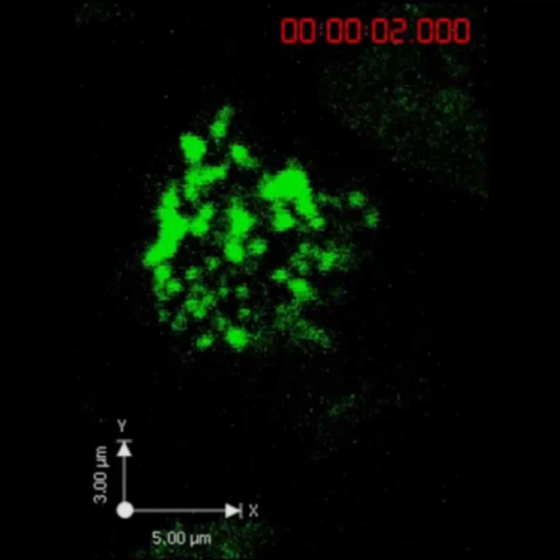Our new approach means we can make a video to see what happens to this receptor from the point at which the two cells first encounter each other. We can see that at this point the receptors immediately come together and cluster into large blobs or clusters. This occurs across the whole interface between the NK cell and its diseased cell.